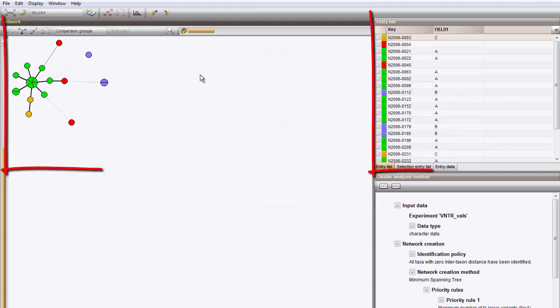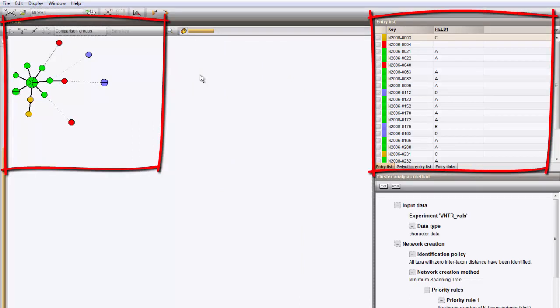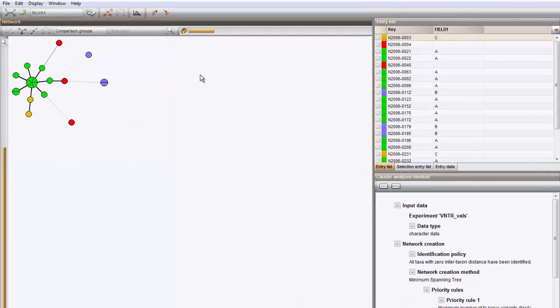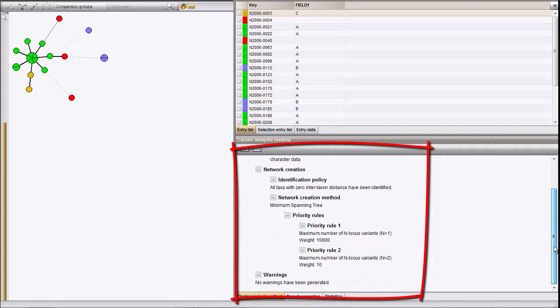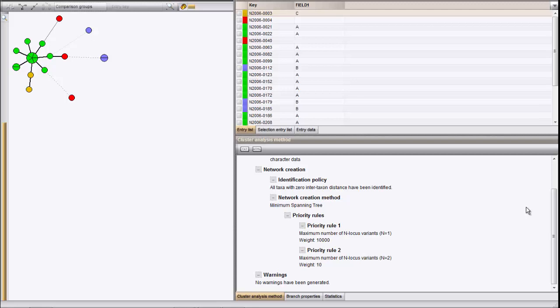The resulting window displays the minimum spanning tree in the Network panel and the Entry list on the right side. The right-bottom panel displays the detailed settings used, for example the priority rules, that result in this particular network.